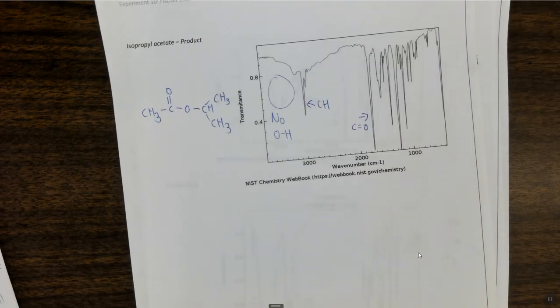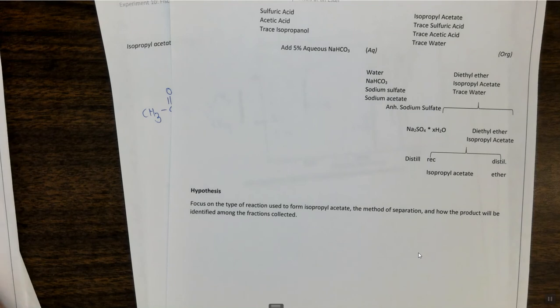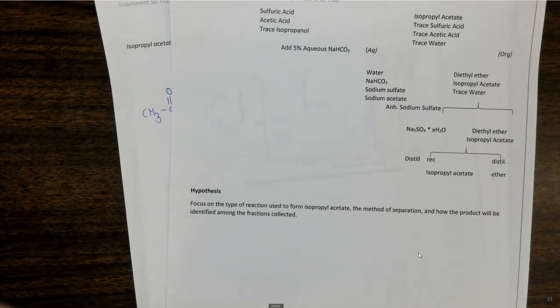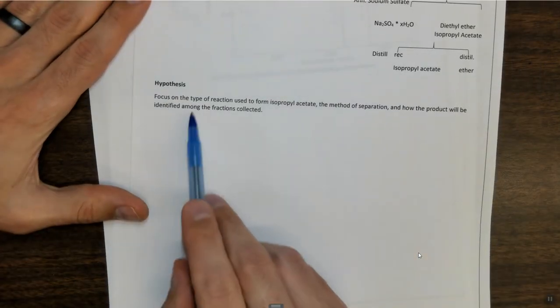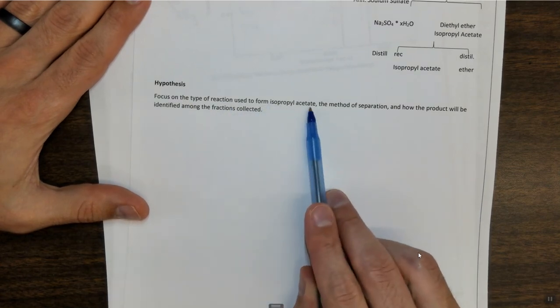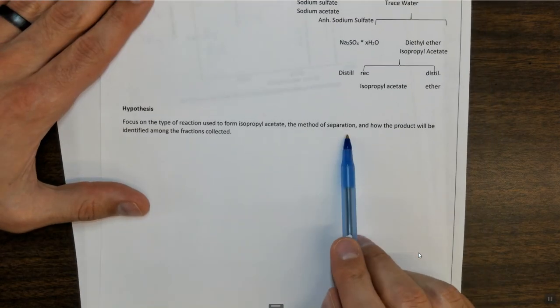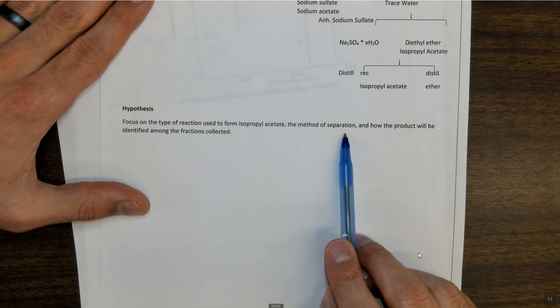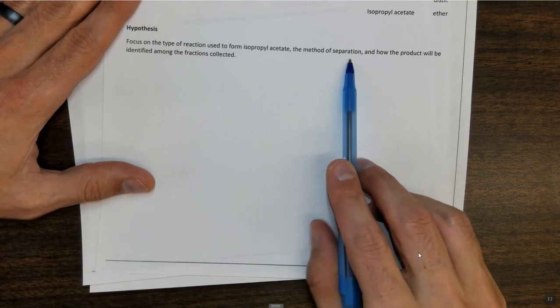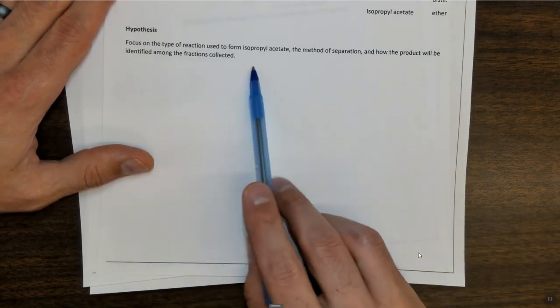So the final thing that I would like to do very briefly is talk about the hypothesis. And the hypothesis that's in your syllabus says, focus on the type of reaction used to form isopropyl acetate, so a Fischer esterification. The method of separation, which is distillation, which separates things based on their boiling point, so the ether boils out first and the isopropyl acetate second, due to the differences in their boiling point, and how the product will be identified among the fractions collected.